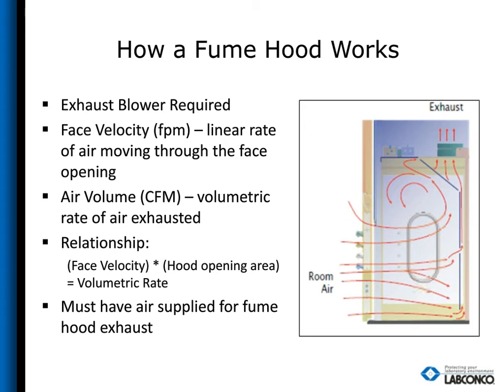The anemometer measures the speed of the air entering that space, and it typically measures that in feet per minute, or FPM for short. Most fume hoods operate between 60 and 100 feet per minute face velocity. Pay attention to manufacturers' published data on this because some fume hoods cannot be operated at lower face velocities, and some are high performance and do really well. But I just urge you to be a consumer on that and do your research about test data and test reports and make sure the hood can operate at lower levels.